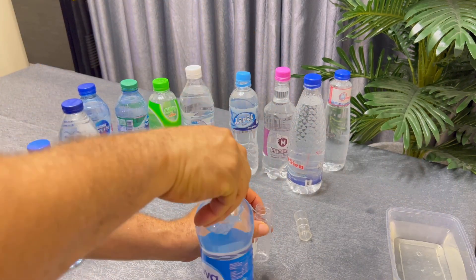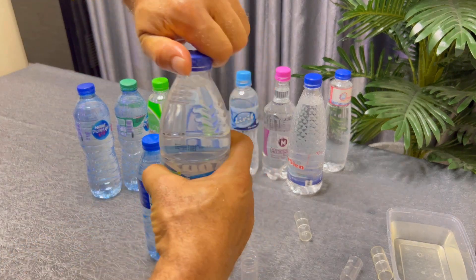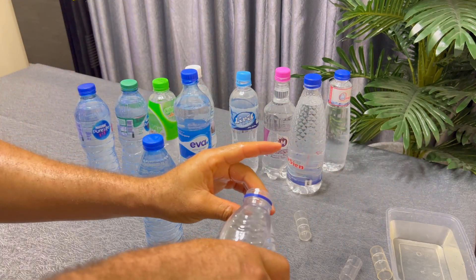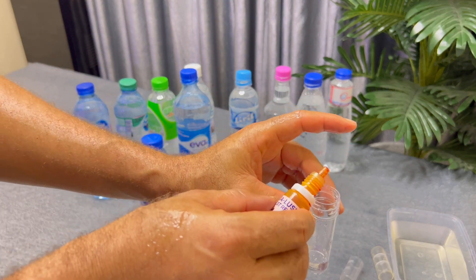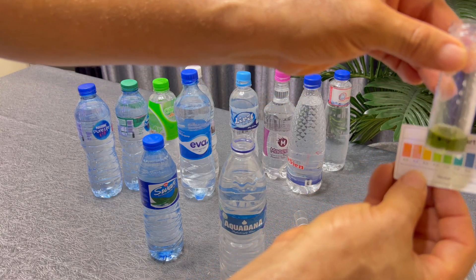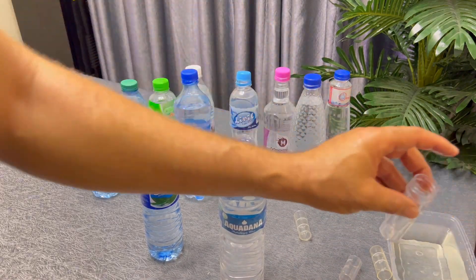We still have Aquafina and a spring water to test. We're going to test Aquafina now. Can you hear that? I use the Aquafina to rinse the test tube first, then drop five millilitres of Aquafina into the test tube and add two drops of the liquid tester. What we have here — pH 7. Aquafina shows the water is normal and it's good.